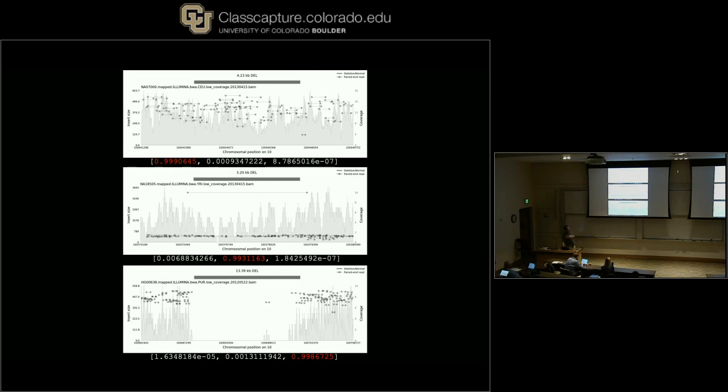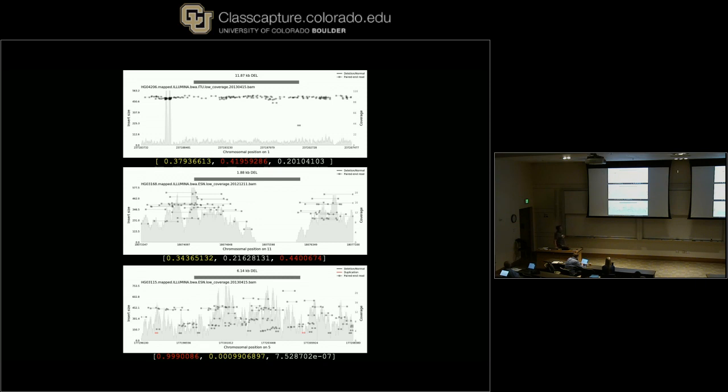Okay, so when does it go wrong? This top one was predicted, with pretty low confidence, to be heterozygous, but in fact it is clearly zero copy loss. So what's going on there? Anybody want to guess what the machine was confused about?